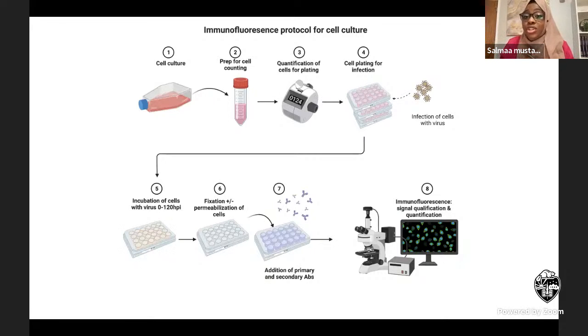So for example, before starting this, we plated all of the cells for all the different time points we were going to use in the future, from 0 to 120 hours post-infection. We just plated them without the virus. At 0 hour, you count them, then 24, 48, 96, and 120, something like that. And then you know, okay, at 48 hours post-infection, this is the number of live cells that I will have. And then you use that for your calculation.